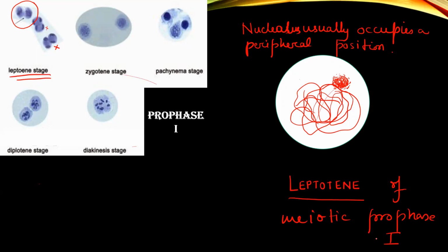Next we come to the second substage called zygotene. In zygotene, what do you see? Again, see the cells are spherical to round in shape, spreading in nature with prominent cell wall. These characters mean what? It is pollen mother cell. These are typical characters of pollen mother cell. This will not tell you whether it is leptotene, zygotene or any other stage. This is common to all, right?